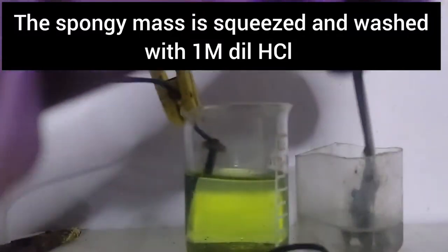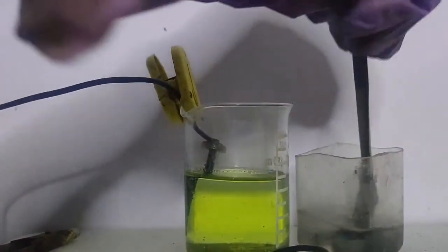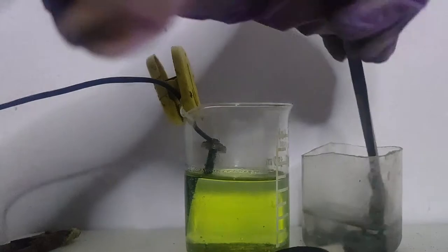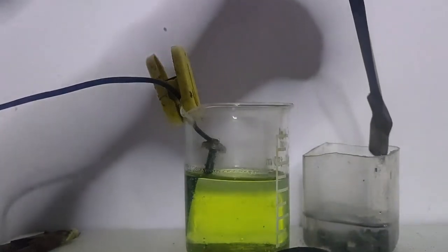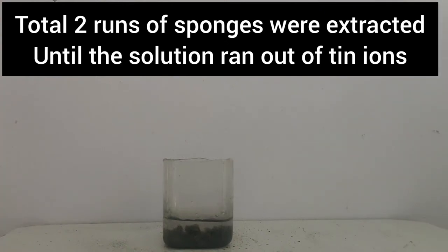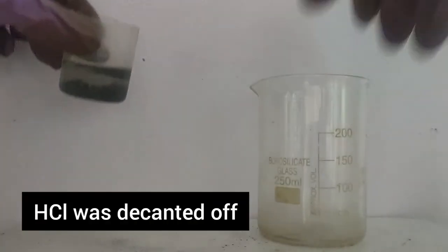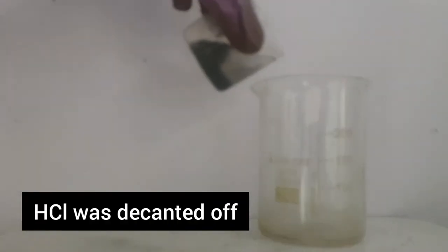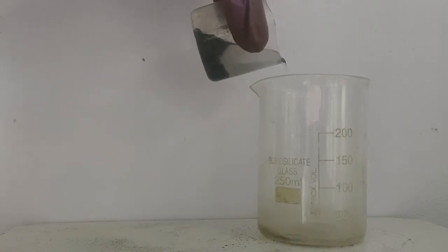The spongy mass was squeezed and washed with 1 molar dilute HCl. Two runs of spongy mass was extracted until the solution ran out of tin ions and the HCl was decanted off.